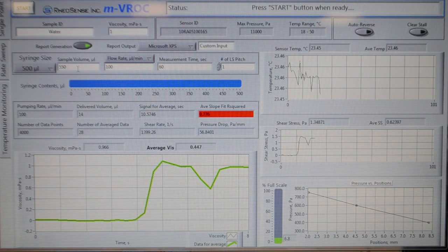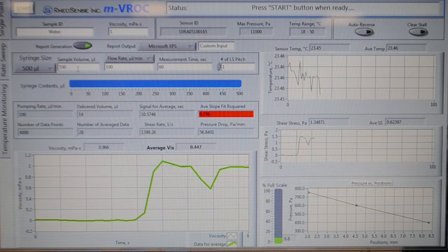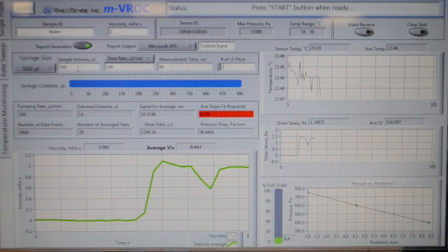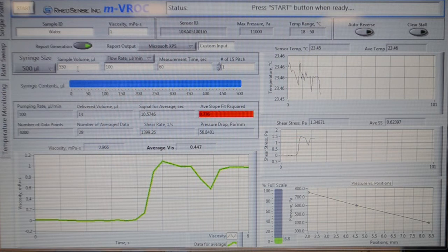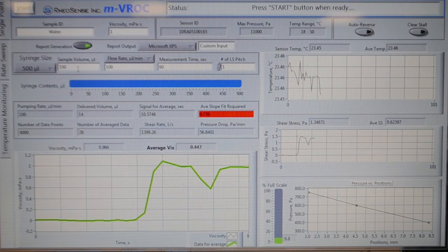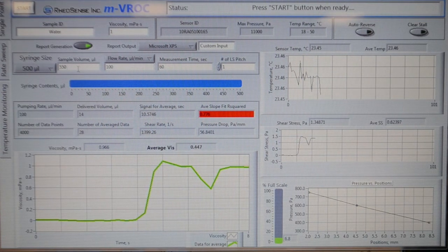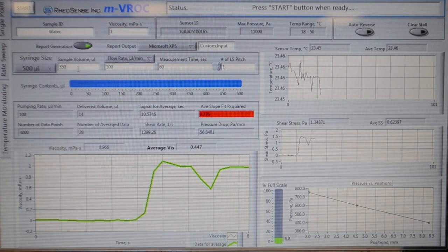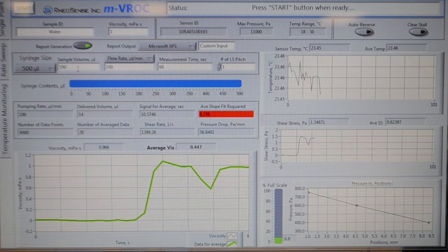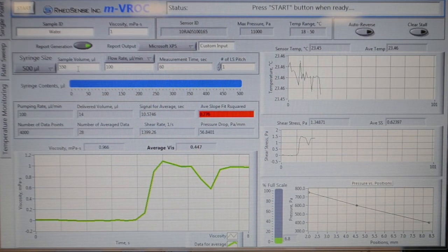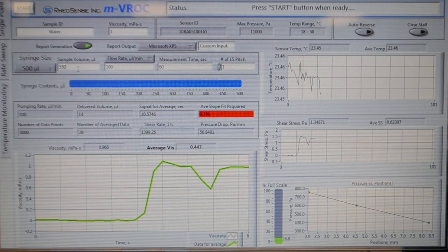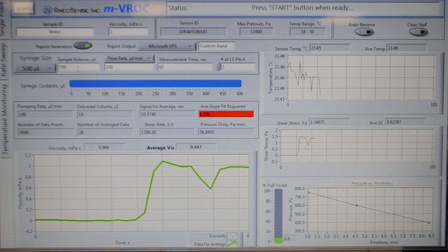Now we may proceed to step 3, sacrificial run. The reason we need to run a sacrificial run is to purge out the air bubbles in the chip and to prime the chip with water. Although most people don't realize, air bubbles can be an issue in MVROC measurement and can alter the results significantly.